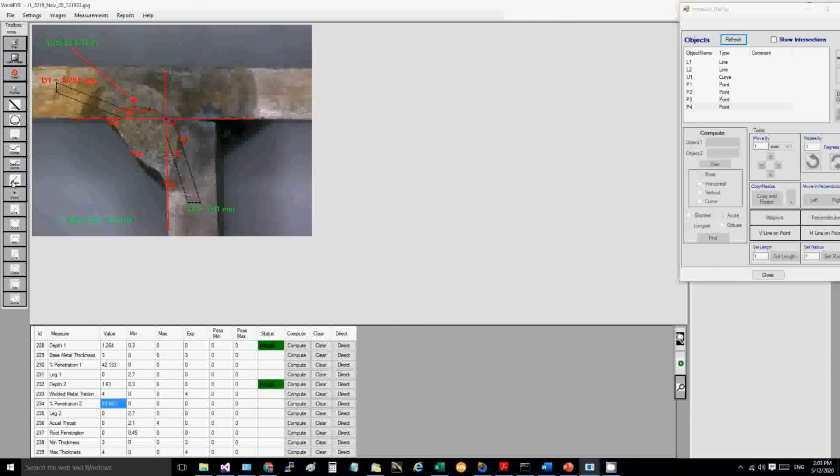If you want to measure an angle, you can use the angle tool. Select 3 points and you can define an angle. If you want to make any alterations to the angle, you can go to the edge and move it, or reduce the angle. Using the mouse, you can move any object, a line, circle, arc, or curve, and change its position. If you want to change the orientation of a line, you can do that also. Any object like a circle, curve, or arc is editable. You can change the orientation, reduce the size, etc. This way you can define all the boundaries and do all the 2D measurements.